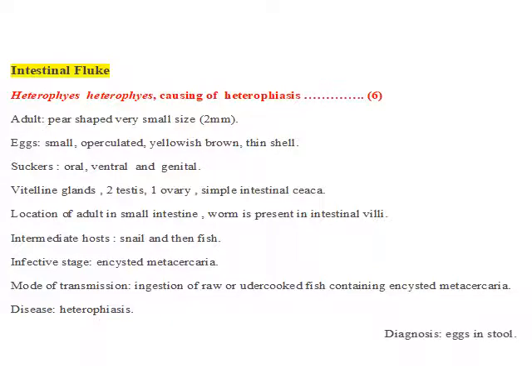Now about its suckers, there are three suckers — not two — which are the oral sucker, ventral sucker, and genital sucker. There is a viteline gland visible clearly, and two testes and one ovary with a simple intestinal structure. This parasite is hermaphroditic, meaning reproductive organs can be found within the same individual parasite.